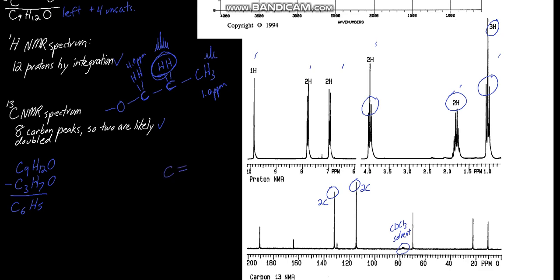Okay. Now let's revisit the carbonyl. The carbonyl is at 190 ppm in the carbon NMR spectrum. Carbonyls are the most de-shielded signals that you'll ever see, most likely. So if you look that up in the carbon NMR table, it suggests very strongly an aldehyde, and you can pretty much believe what you see in that carbon NMR chart in that region of carbonyl groups. An aldehyde should have an aldehyde hydrogen, characteristically 9 to 10 ppm, and sure enough, there it is. So with those two, we're pretty much certain that we have an aldehyde group.